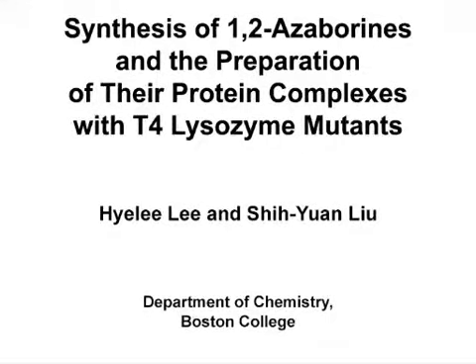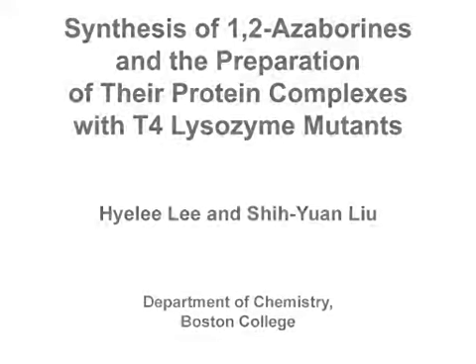The overall goal of this protocol is to describe a general method to synthesize 1,2 azaborines and its potential application in biomedical research. The main advantage of this technique is that it shows a short synthesis of 1,2 azaborine compounds, which are emerging boron-containing isosteres of the ubiquitous benzene motif.